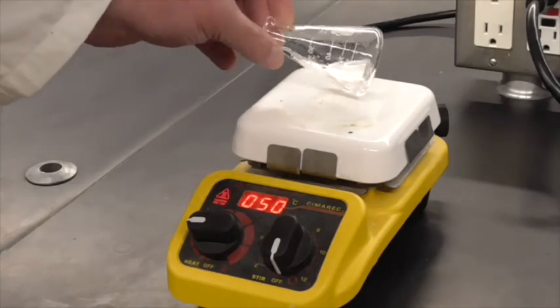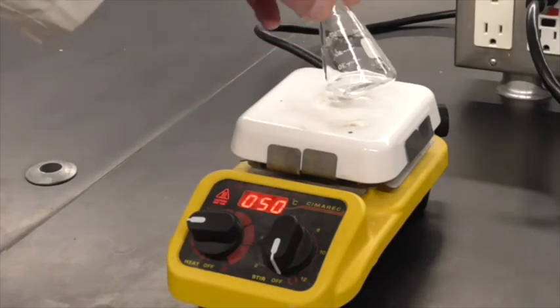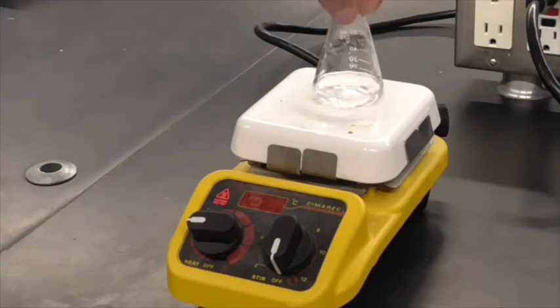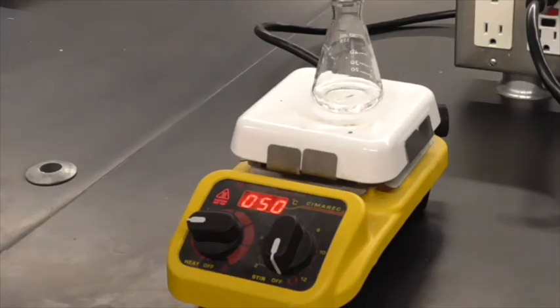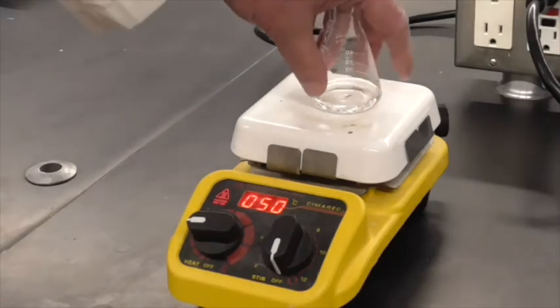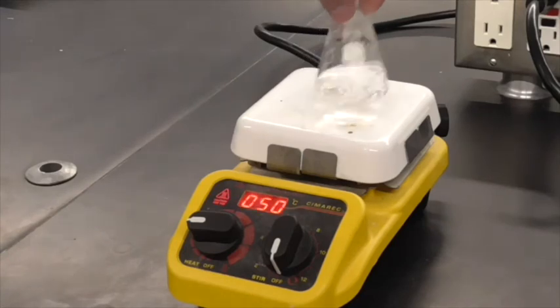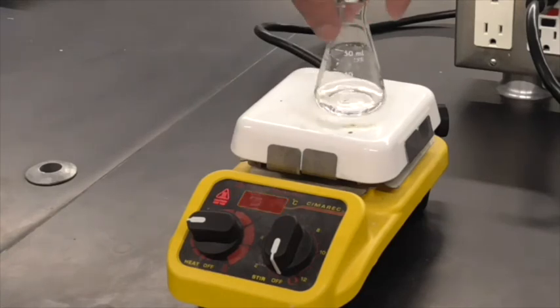Just trying to get all the crystals off the side. Alright, give it a few more seconds here, but that's about all we need. Just wanted to get all the salicylic acid to dissolve.